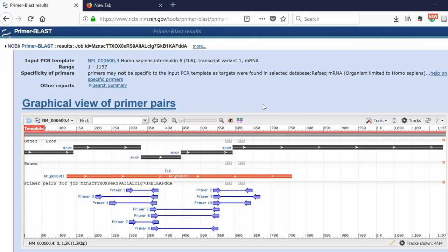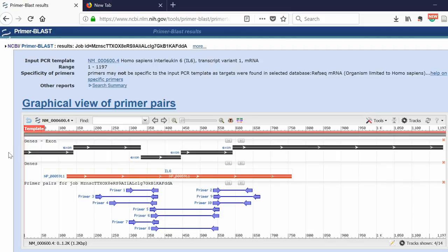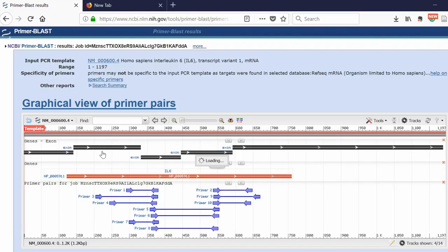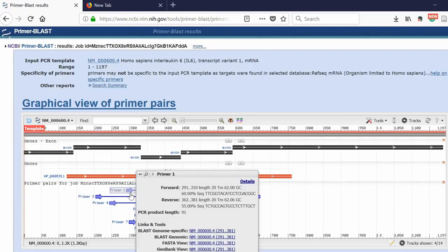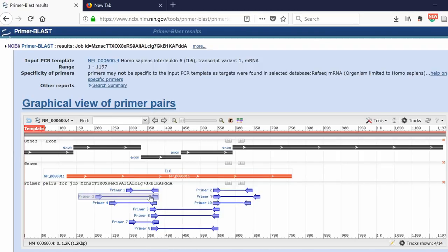Now you've been presented with the results. At the top, you'll have the graphical view of the primer pairs. What you have at the top in the grey bars are the exons for your gene. In this case, this is the interleukin-6 gene in humans. As you can see, there are five exons here: one, two, three, four, five. Underneath, you've got your primer pairs. The arrows signify the primer pairs: the forward primer and then the reverse primer.